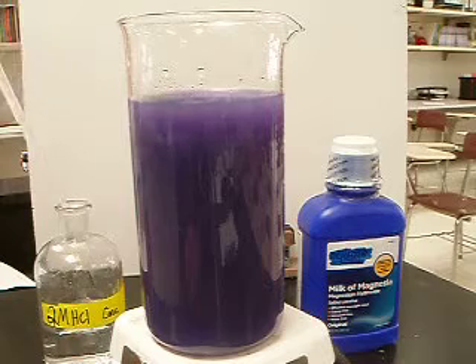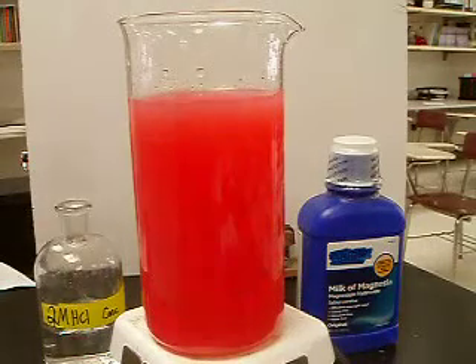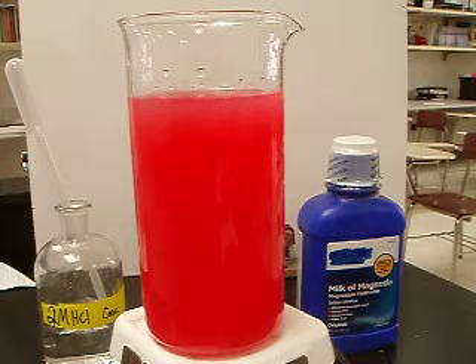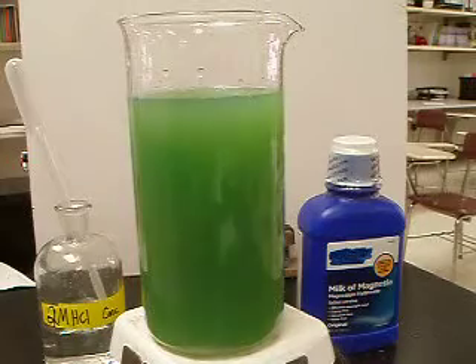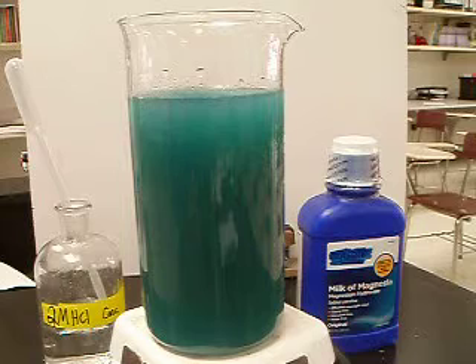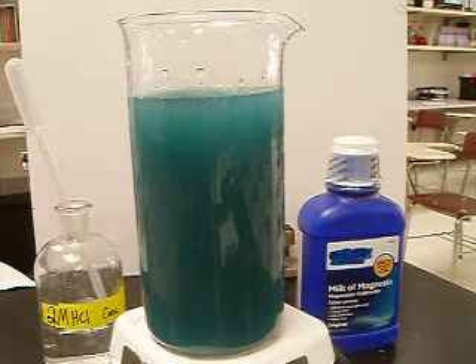We'll go ahead and drop in a lot more acid. There we go — we'll get that nice pinkish-red color. And now that's going to slow the reaction down a lot. The hydroxide ions are being chewed up by the acid, and the magnesium hydroxide is slowly dissolving and dissociating. You can see it takes a little bit of time to get back to purple. That's because when it gets cold, it takes a long time for the magnesium hydroxide to dissolve, which means it's going to take that much longer to dissociate.